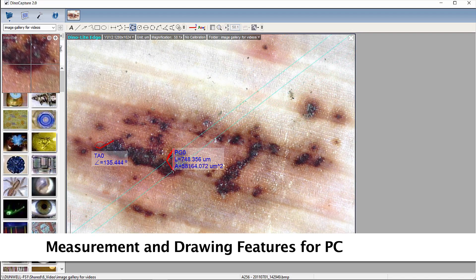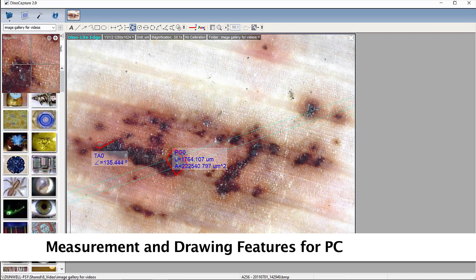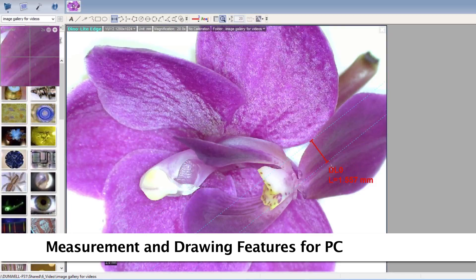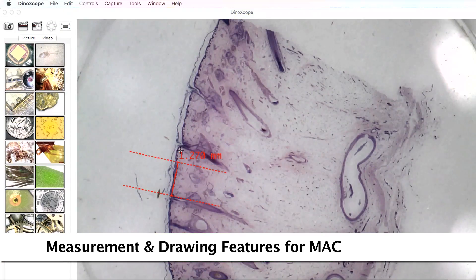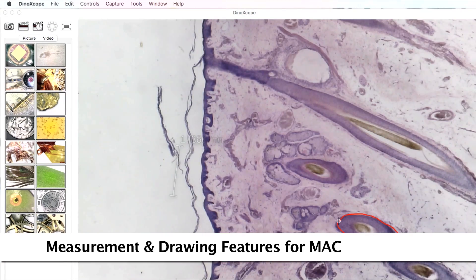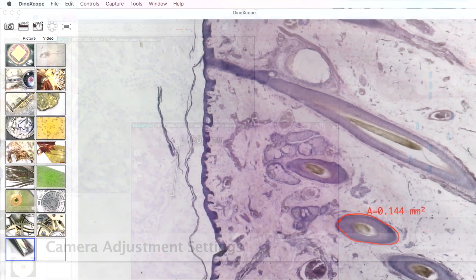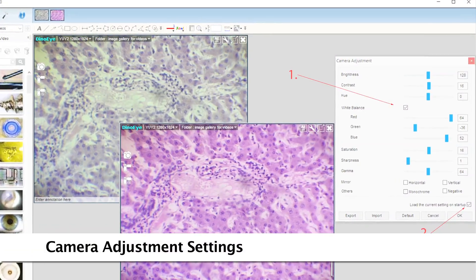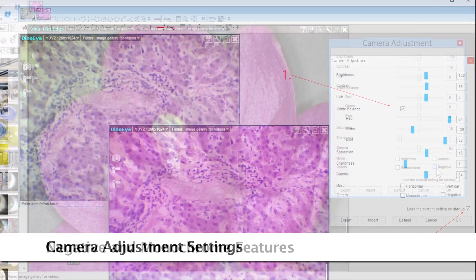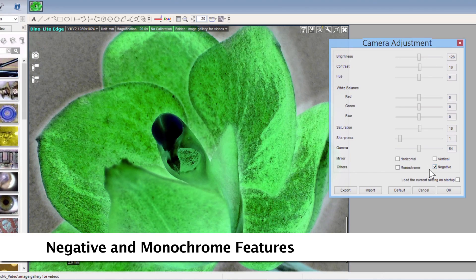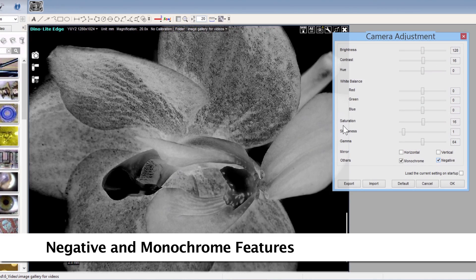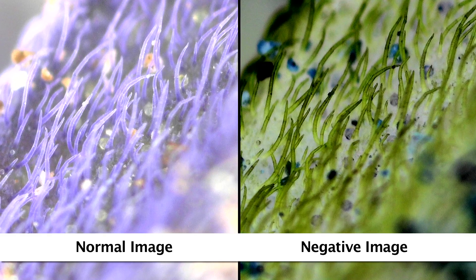The included software has measurement for compatible measurement models as well as drawing and annotation tools. Some adjustable camera options include white balance, brightness, contrast, hue, as well as negative and monochrome modes and more.